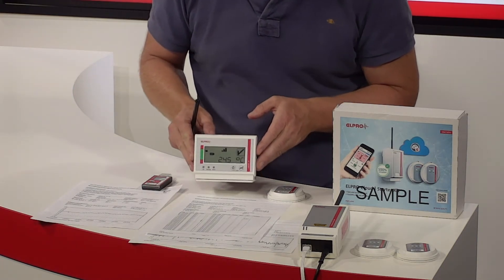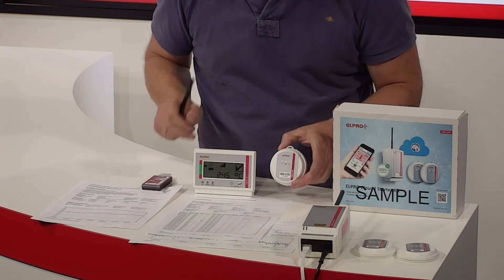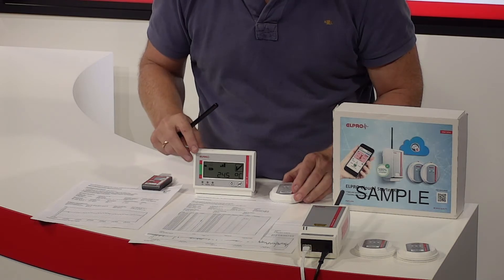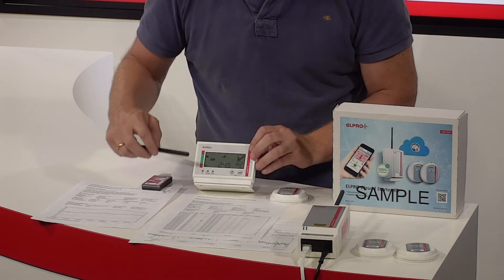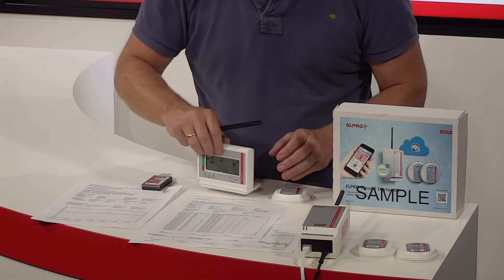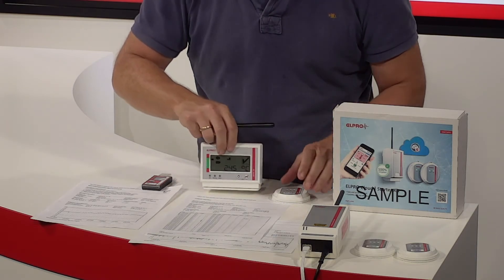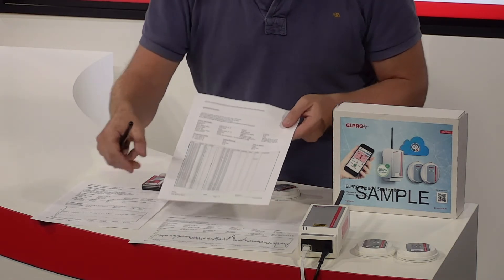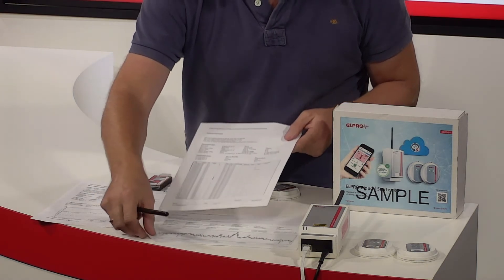This is the Libero W, consisting of the base and the wireless sensor sitting inside the fridge or the storage facility. This device has alarming on the display and it also beeps and warns via blinking LED. Every month you connect it via USB to a computer and generate a handy min-max report, and as a second page you also have a measurement row.